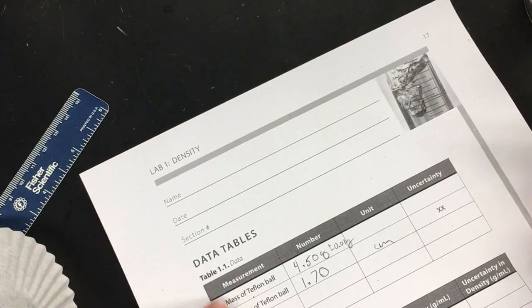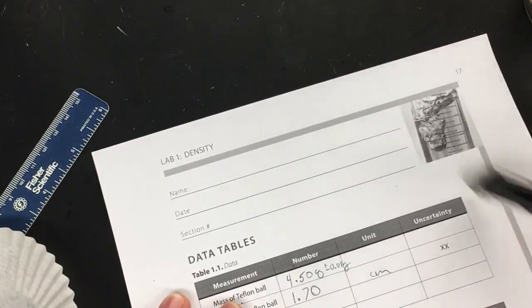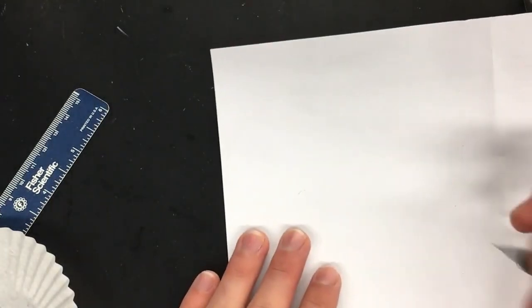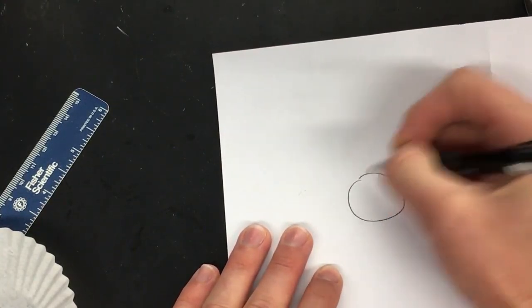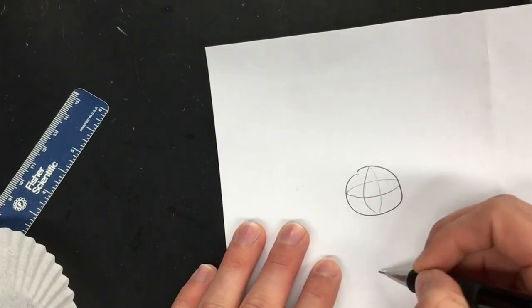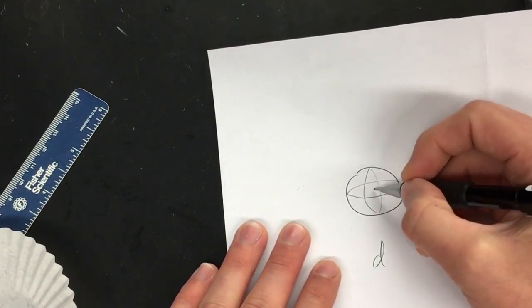And they're not so keen on the uncertainty here in this little diagram thing, so we're not going to worry too much about the uncertainty. The other part of this is, let's say we have our sphere, right? Okay, that's our round object. Well, I just took a diameter.